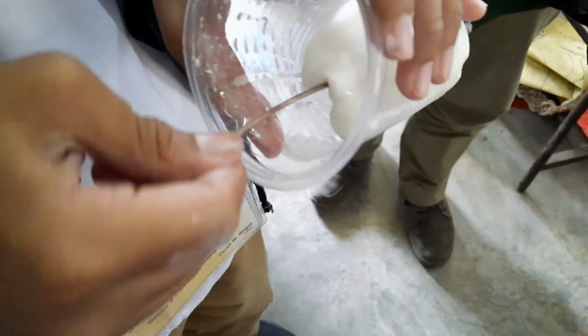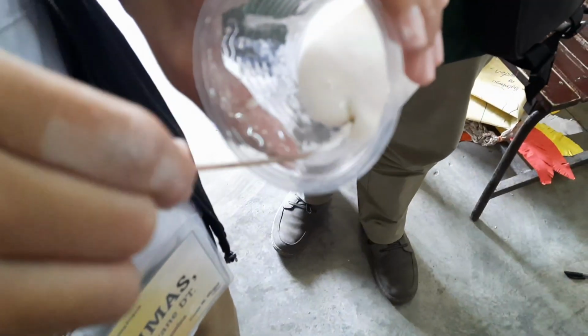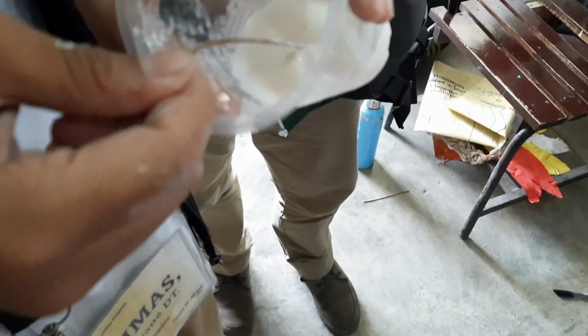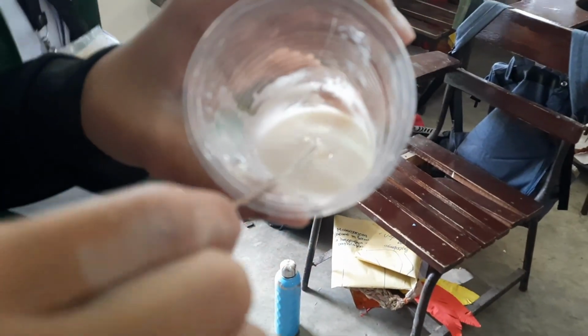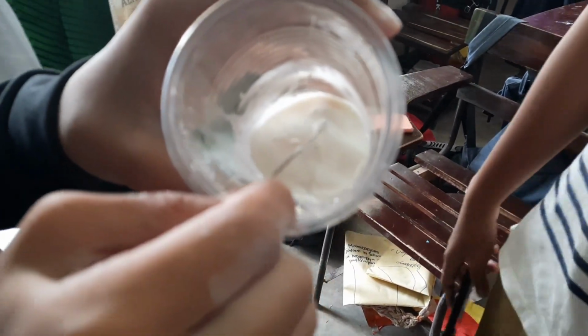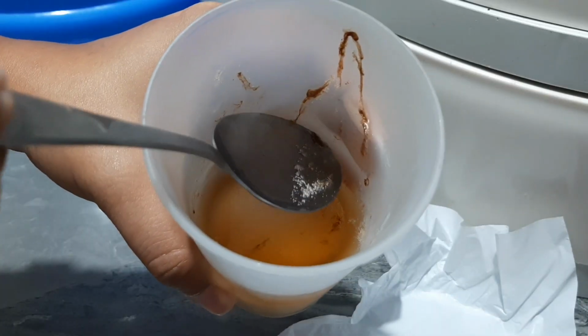In this experiment, students can make glue using a protein in milk called casein. They separate the casein from milk by coagulation and precipitation. Now, let us have the setup C.